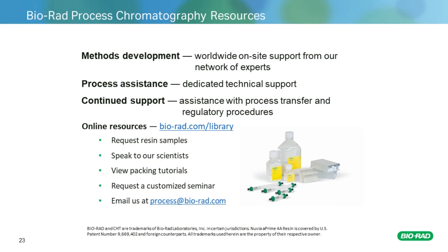Okay. And can it be a regulatory problem to have an additive in the buffer? I assume the additive needs to be removed after, or tests need to be performed that show that the additive does not end up in the final API formulation. This is a great question. It actually depends on what you are adding.